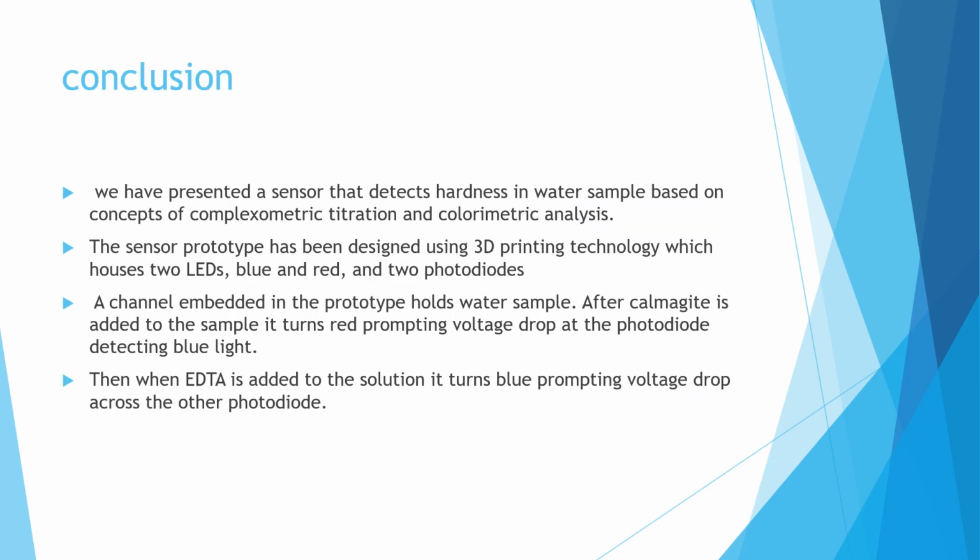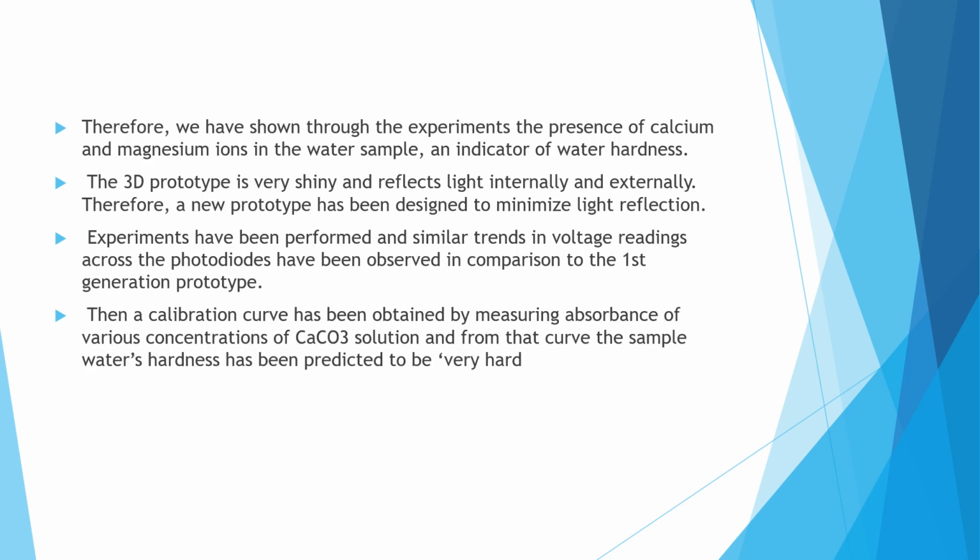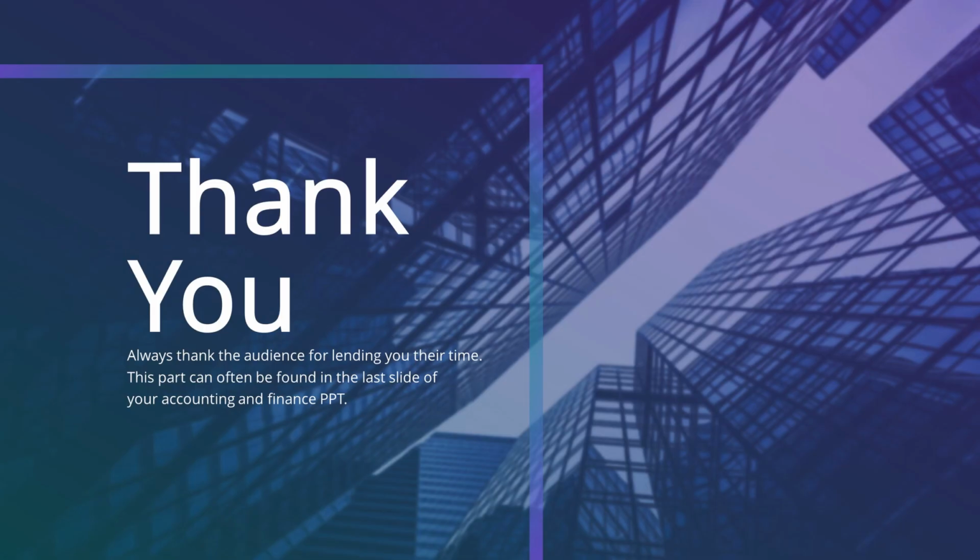When EDTA is added to the solution, it turns blue, prompting a voltage drop across the photodiode. We have presented a sensor that detects hardness in water samples based on concepts of complexometric titration and colorimetric analysis. Thank you everyone.